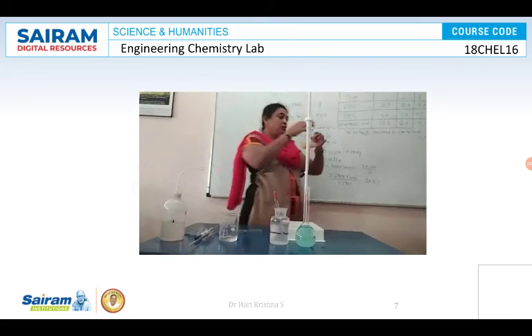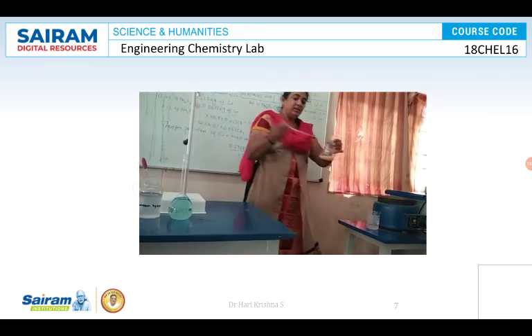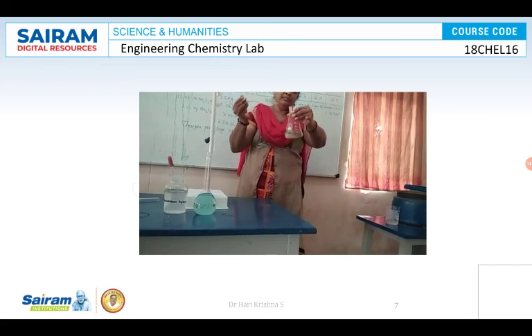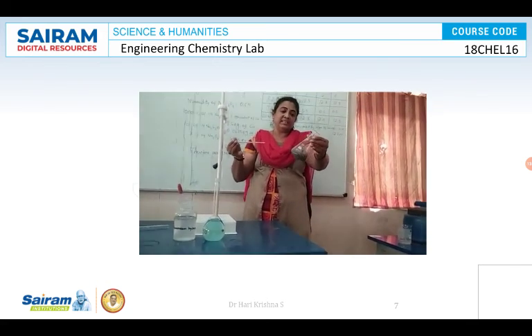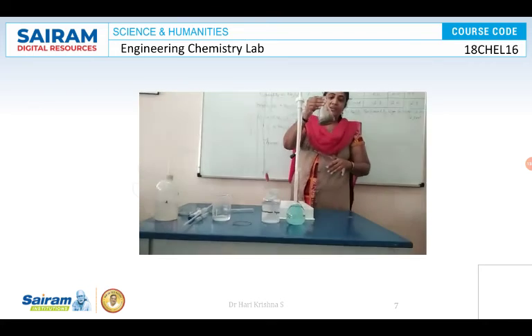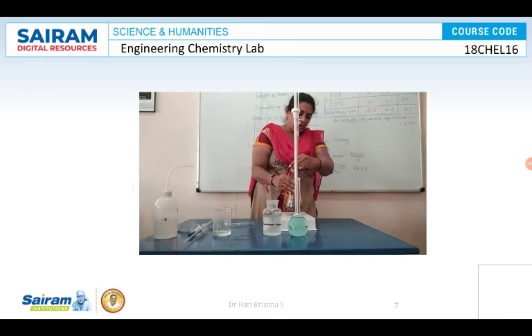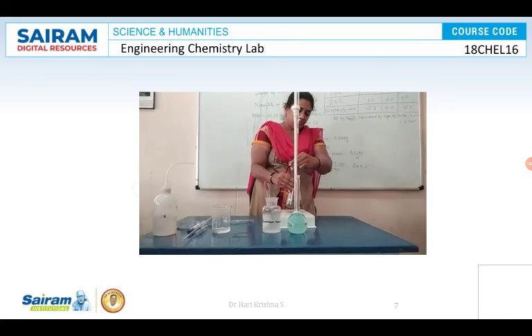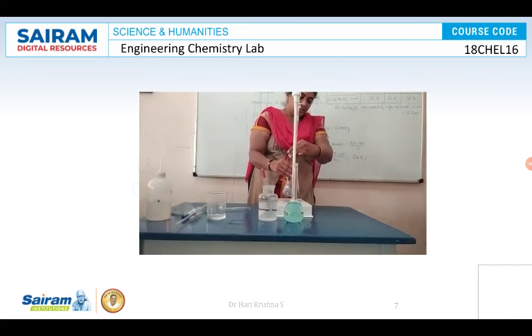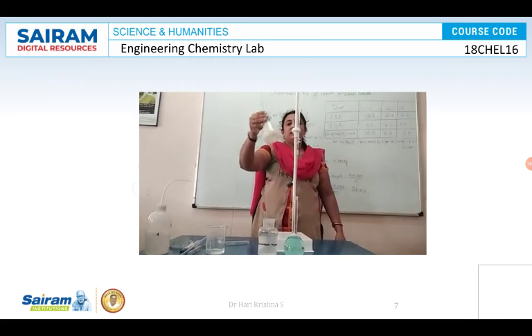Now at this stage, you have to add few drops of starch indicator. When you add starch indicator, the solution will become dark blue color. Add few drops of starch indicator. Once again titrate to get a clear white precipitate. That is the end point. Once again titrate to get white precipitate. We got it. This is the end point.